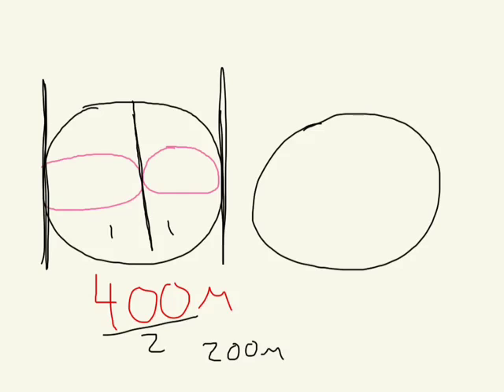Now, it's not always this simple. Sometimes we're looking at cells and they look like this, spread out and small, or we could have it where they're a little bit larger and still scattered out, but you can roughly estimate the size.